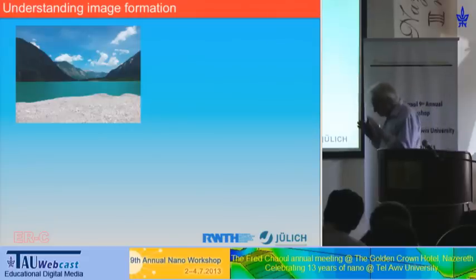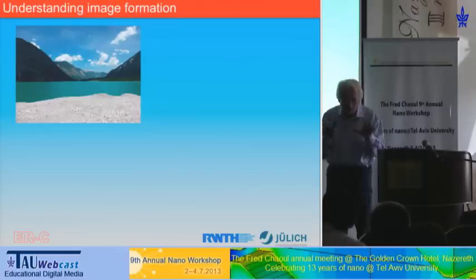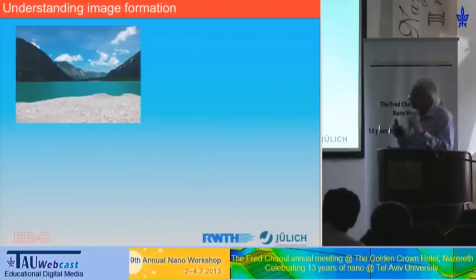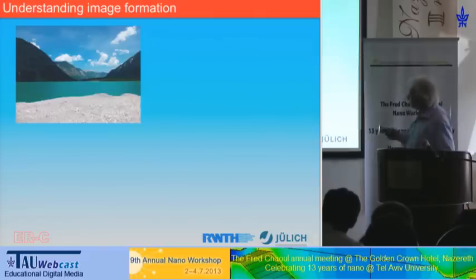Now you see the whole thing is an intricate problem, and you also understand by now, I think, that you cannot simply look at the images and interpret them as it's normal. That means the image interpretation becomes an interesting point now. And we, of course, know that in normal light optical vision, in photography, light microscopy or so, your brain automatically interprets your images.